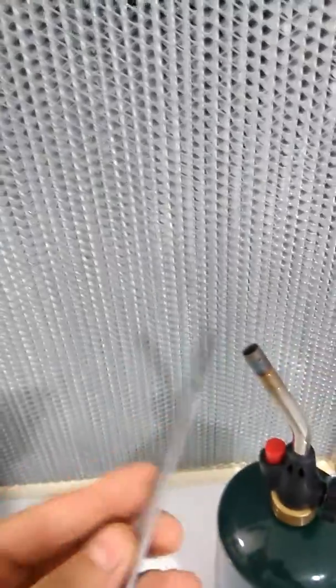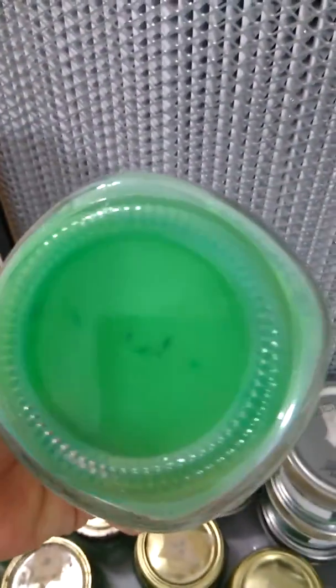Anyways, we're doing transfers. I always burn the scalpel between the two cuts. I got my propane torch out here. I'll leave it on and burn my scalpel between every cut. Try to cut from the leading edge. If you're able to identify sectors, then look for a good sector in it.